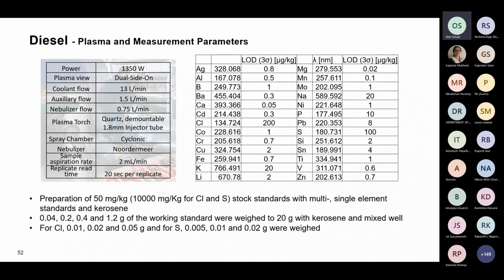To cater for viscosity differences, as samples with different biodiesel content might need to be analyzed, yttrium was used here as an internal standard. Limits of detection in diesel fuel in the microgram per kilogram range, well below the requirements, were obtained for sodium and potassium, the earth alkali elements, as well as for the metals and the non-metals such as phosphorus, sulfur, and chlorine, which can be determined in addition without the need to employ other analytical techniques. Now, the same methodology may also be applied for other petrochemical products. Kerosene as a diluent works equally well for fresh and used lube oils as well as for gasoline.